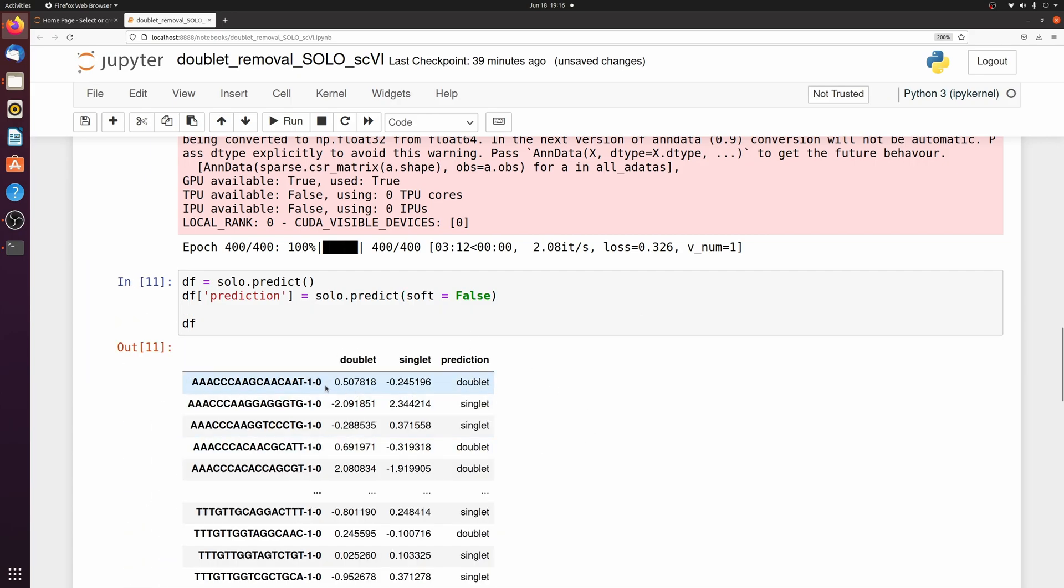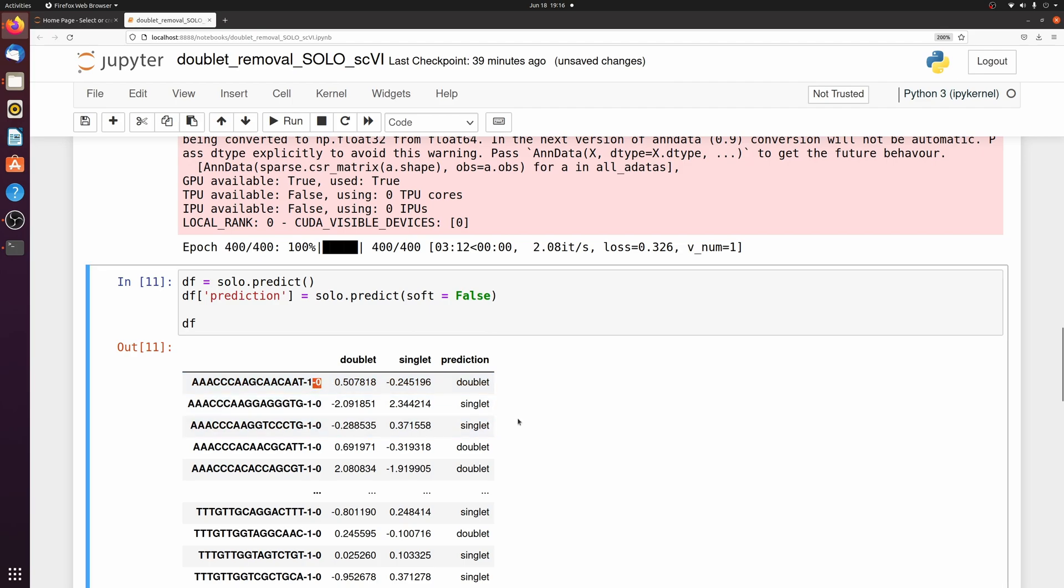Okay, so now we have those two combined. And then I'm going to do one little modification so we don't run into issues downstream. When we run scvi it adds this dash zero on the end of the cell barcode, so I'm just going to remove that.